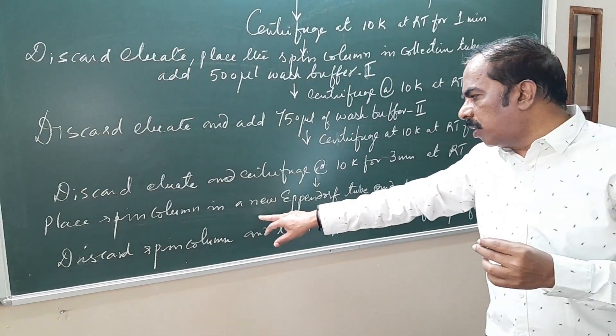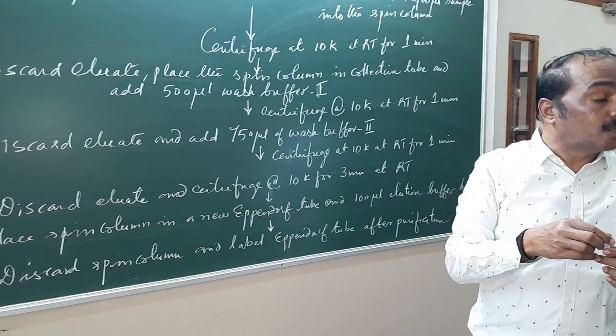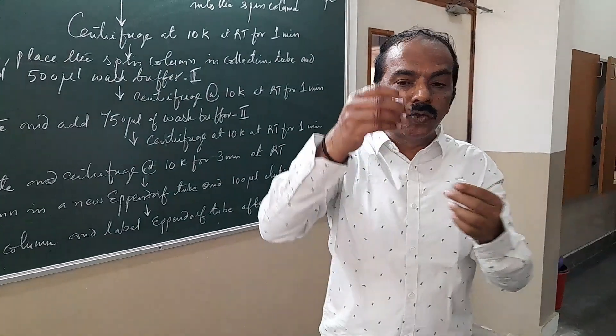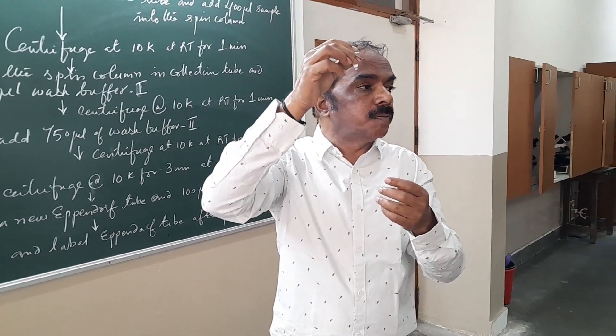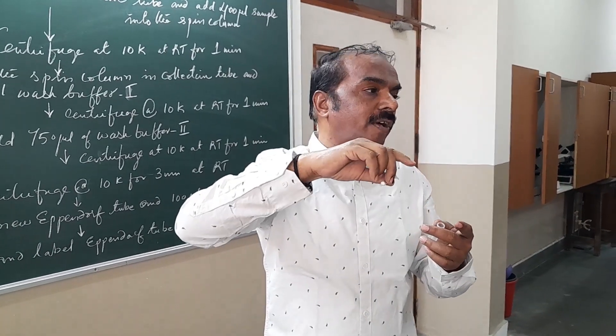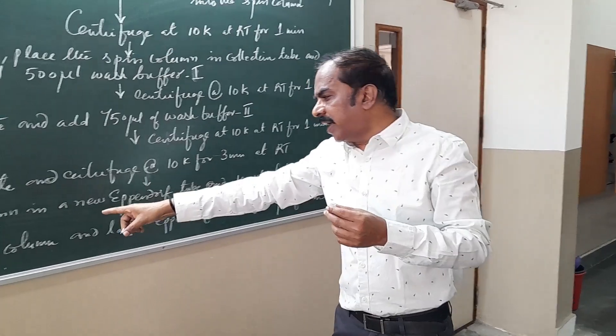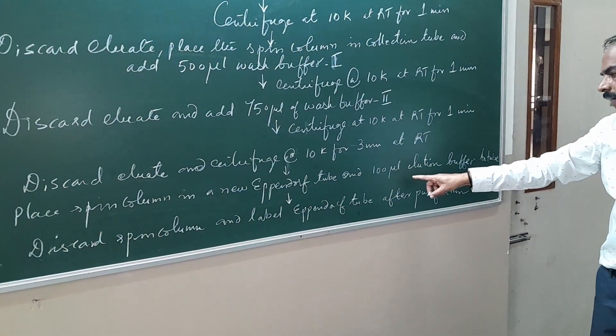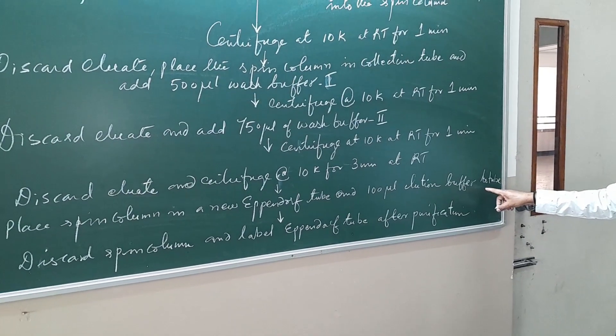Now place the spin column in a new Eppendorf tube. We are using the spin column and keeping it in a new Eppendorf tube. Add 100 µL of elution buffer.